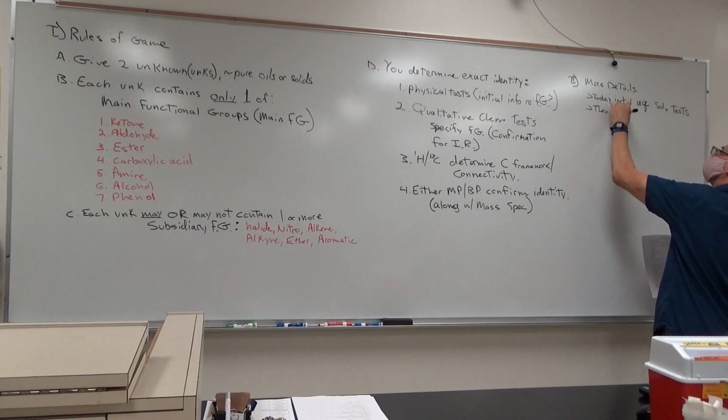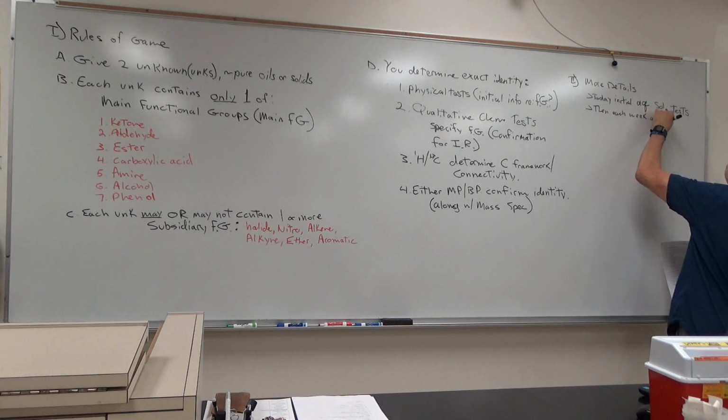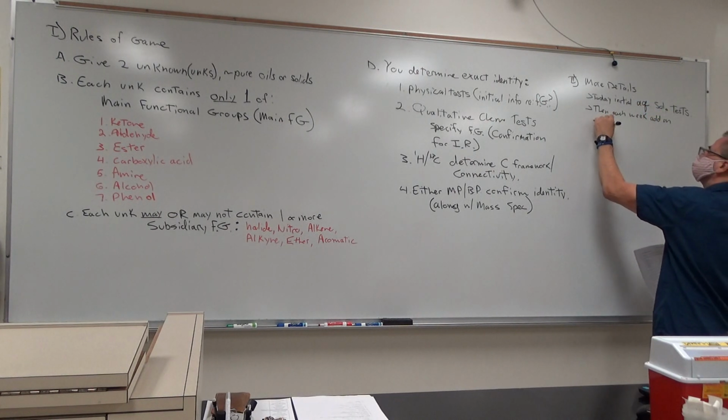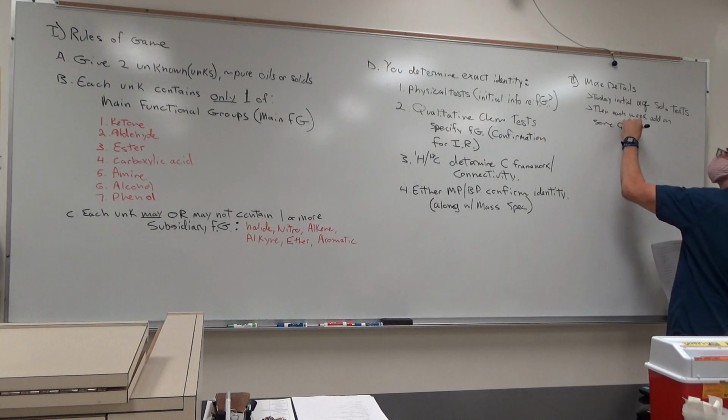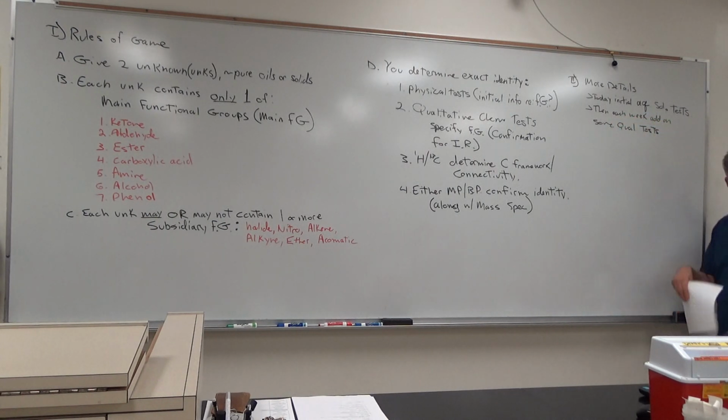Each week, you add on some qualitative tests. Next week we start doing the DNP test and the iodoform test and stuff like that.